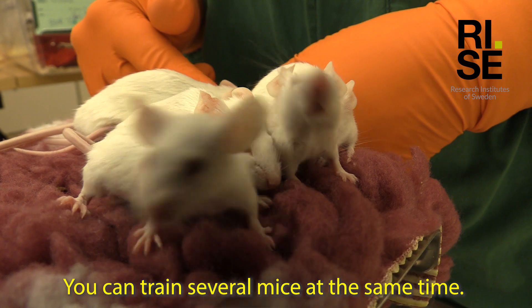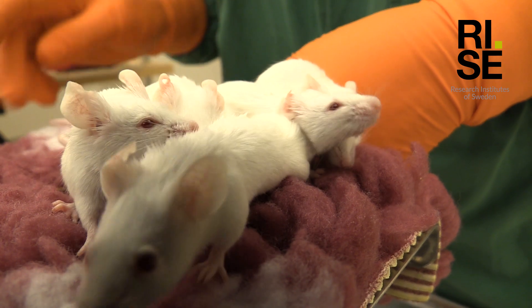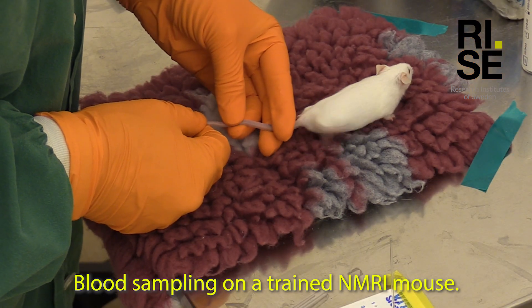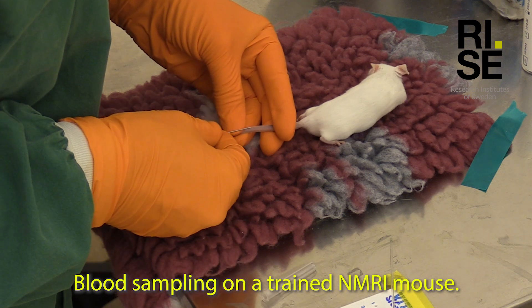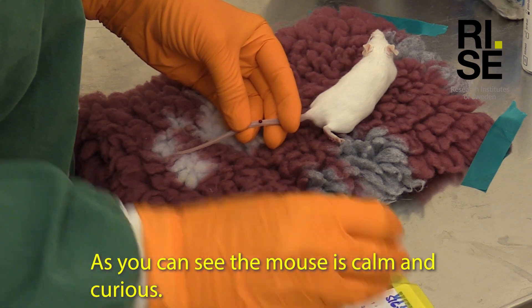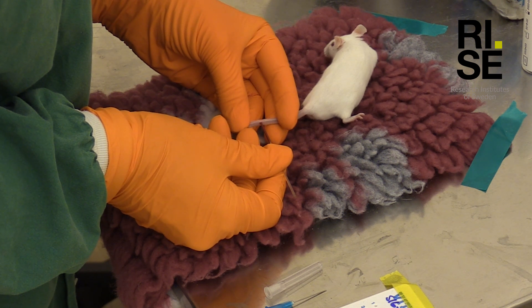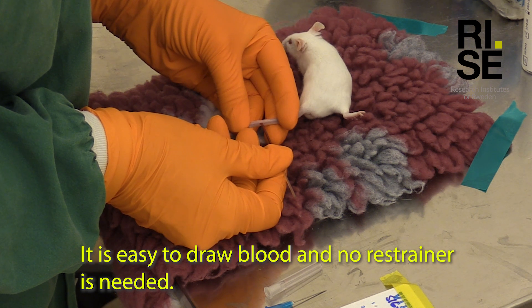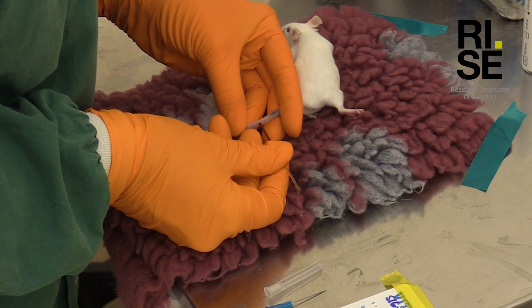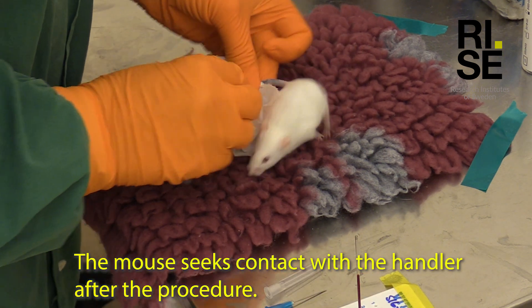You can train several mice at the same time. Blood sampling on a trained NMRI mouse. As you can see the mouse is calm and curious. It's easy to draw blood and no restrainer is needed. The mouse seeks contact with the handler after the procedure.